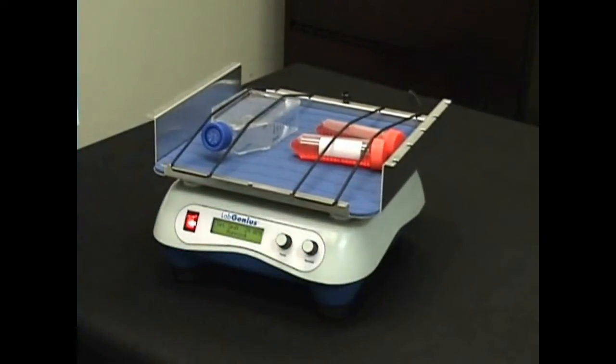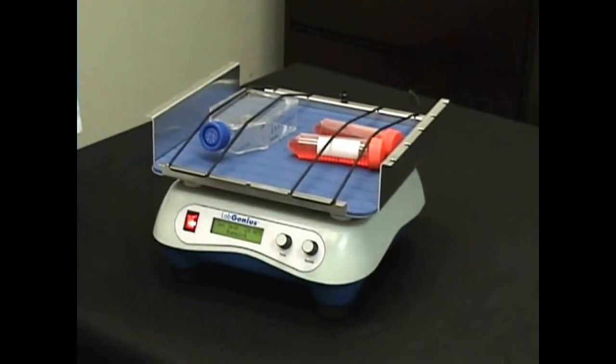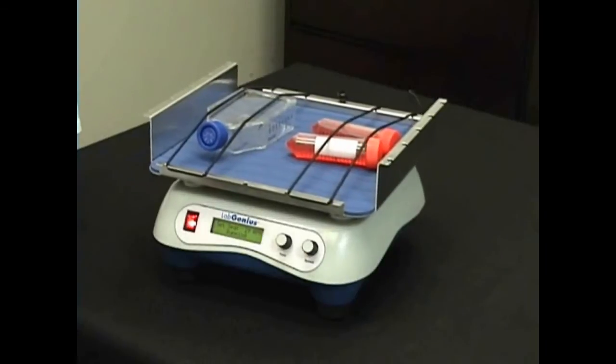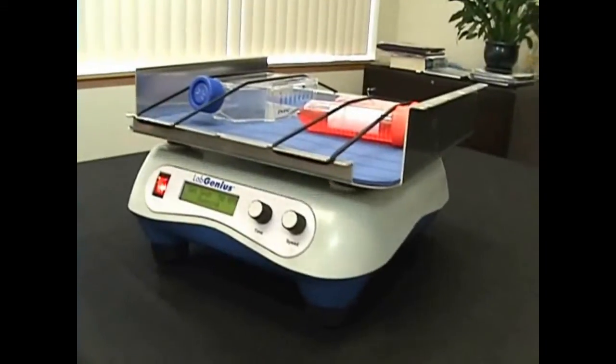The LabGenius Digital Orbital Shaker is perfect for a wide variety of applications. Accurate slow start decreases risk of spills from flasks and beakers.